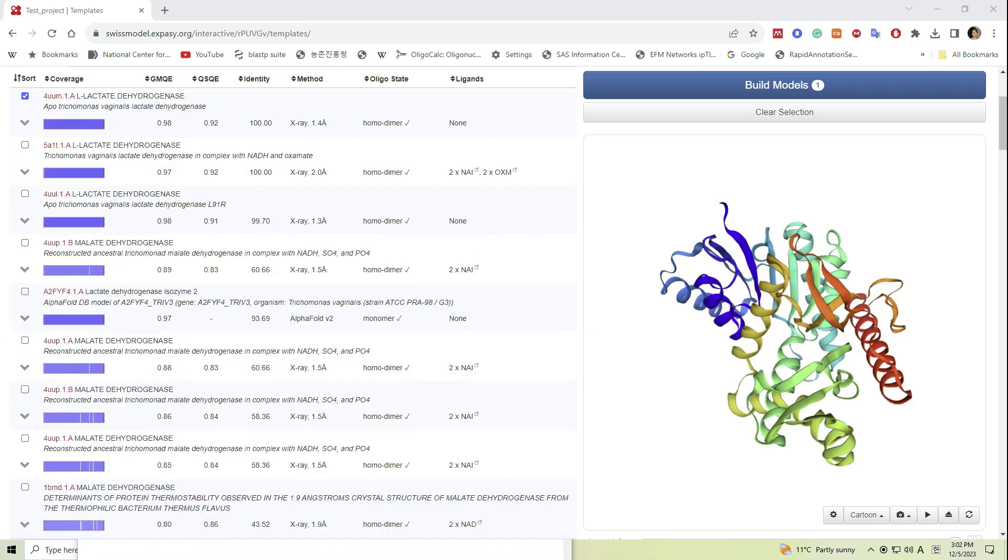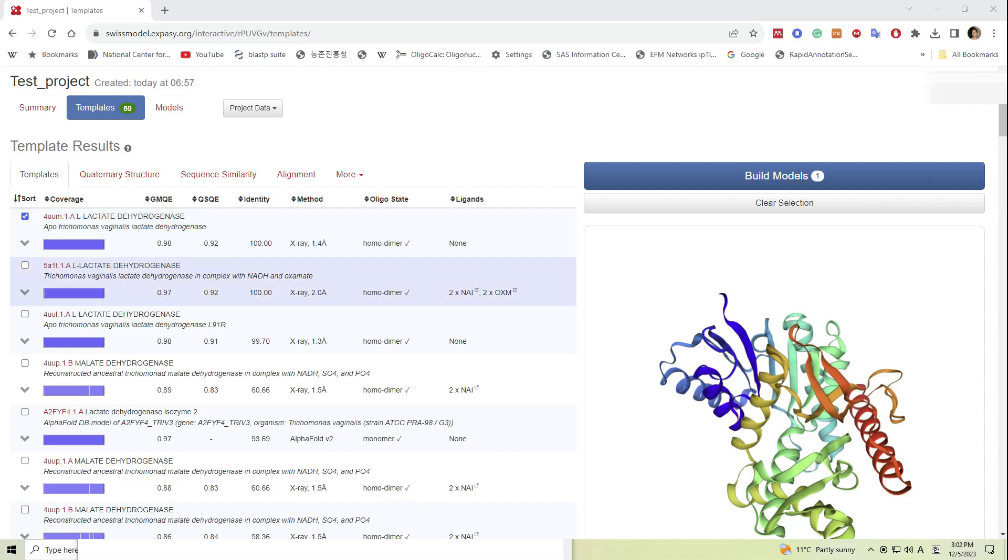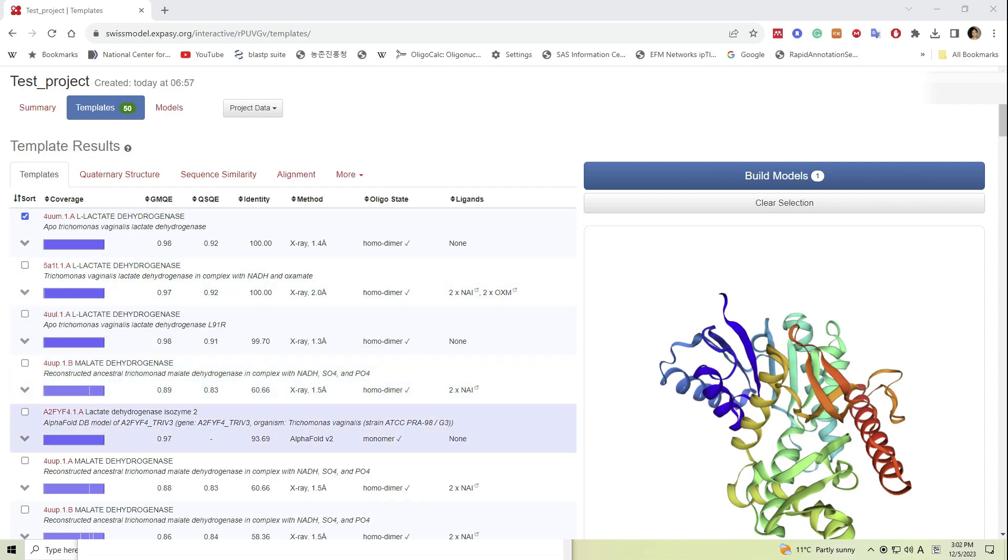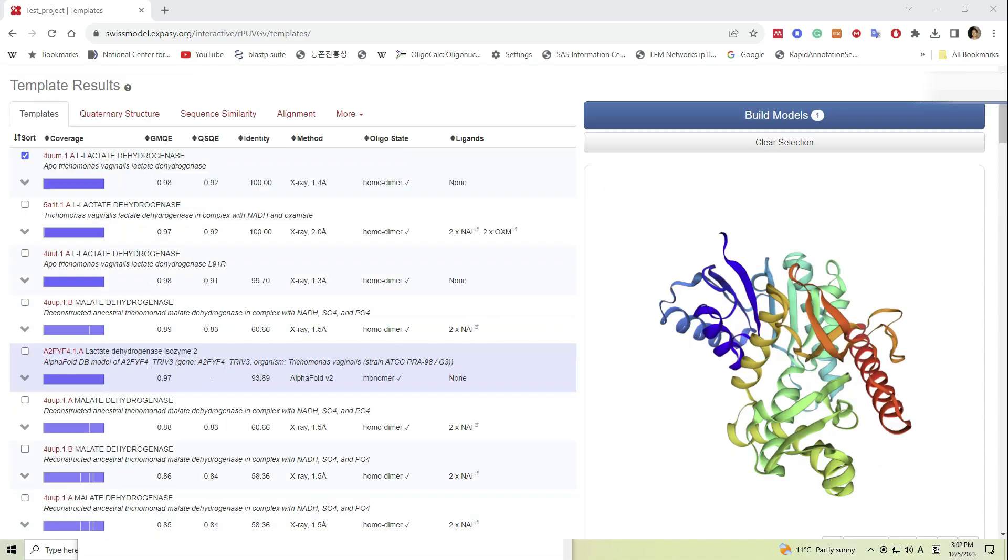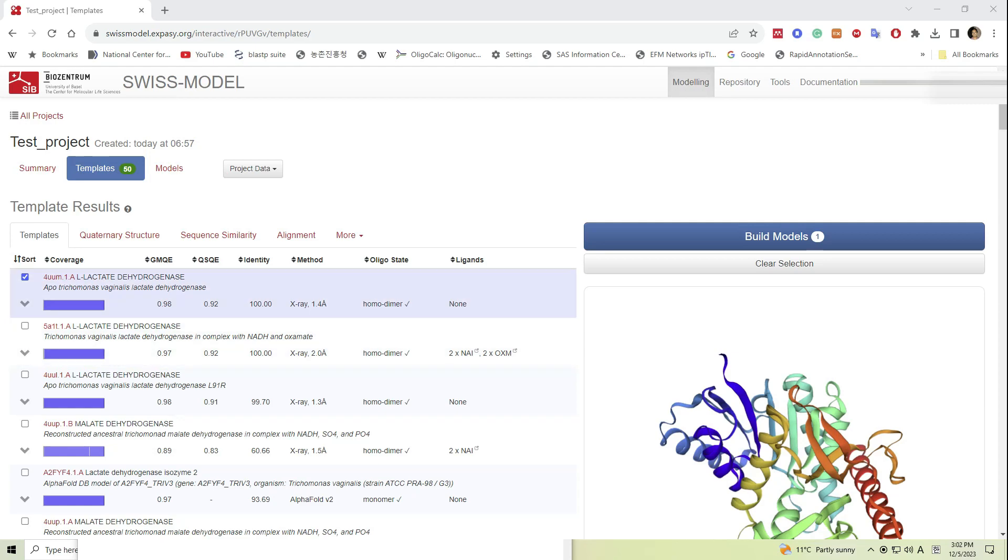A few other additional information are also presented, such as method, oligostate, and information about the ligand attachments. Now we can select models by checking on the checkbox, and here N-terminus to C-terminus color-coded protein structures of the templates will be displayed.